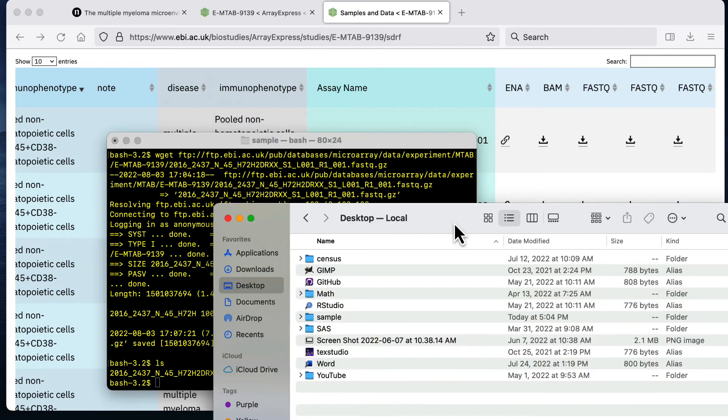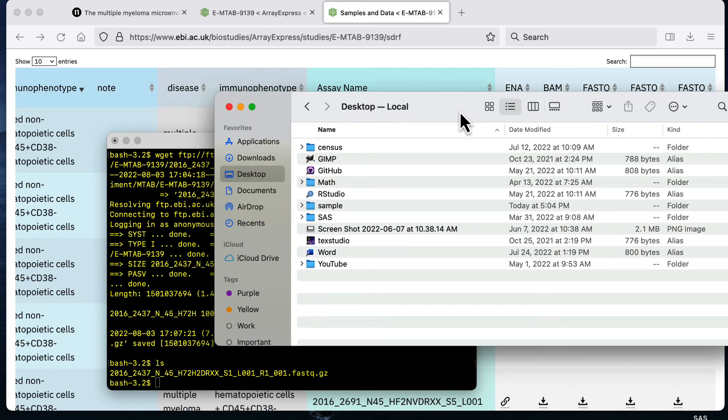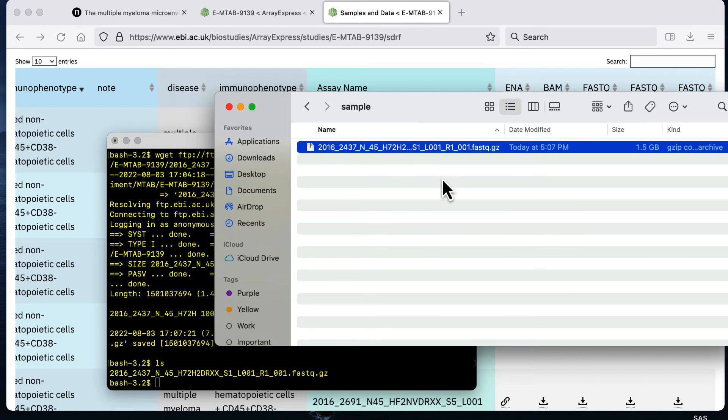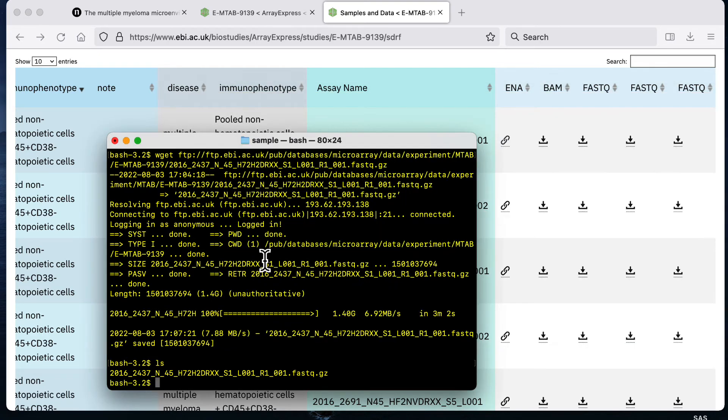Since I was actually downloading it into my Mac local machine, I can also just check using the GUI. If I go to the sample folder we see that I have this file and it's about 1.5 gigabytes large. That's pretty much how you would download the data assuming you have the wget command in Linux.